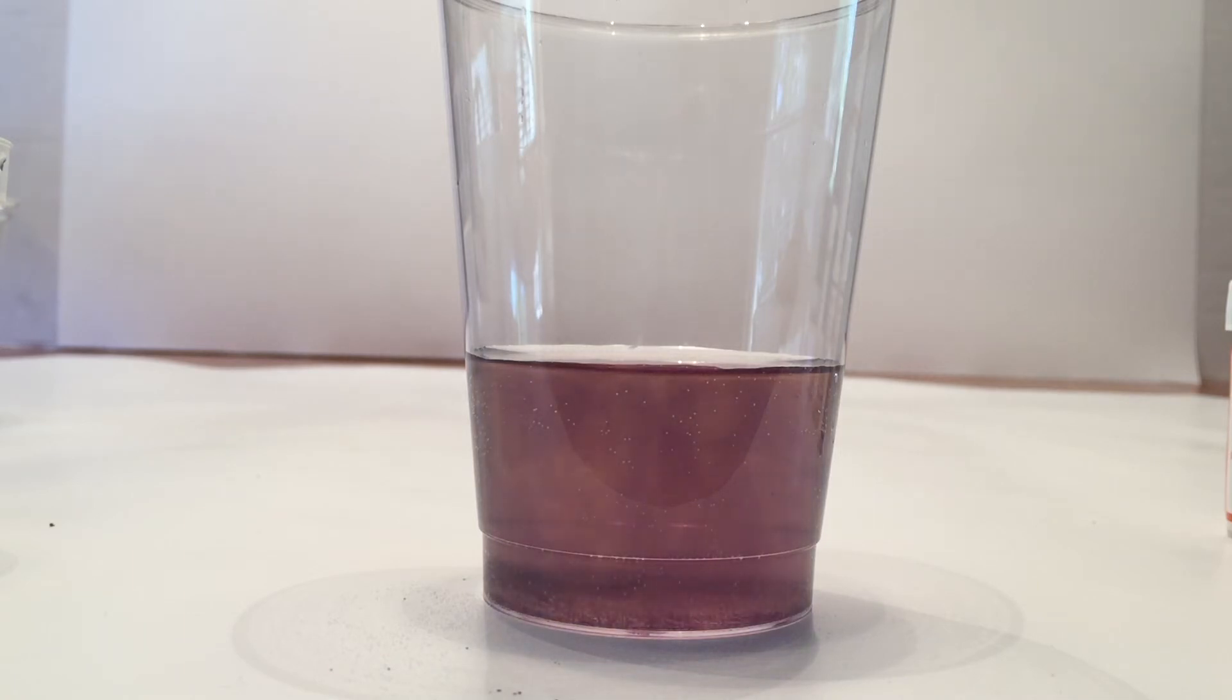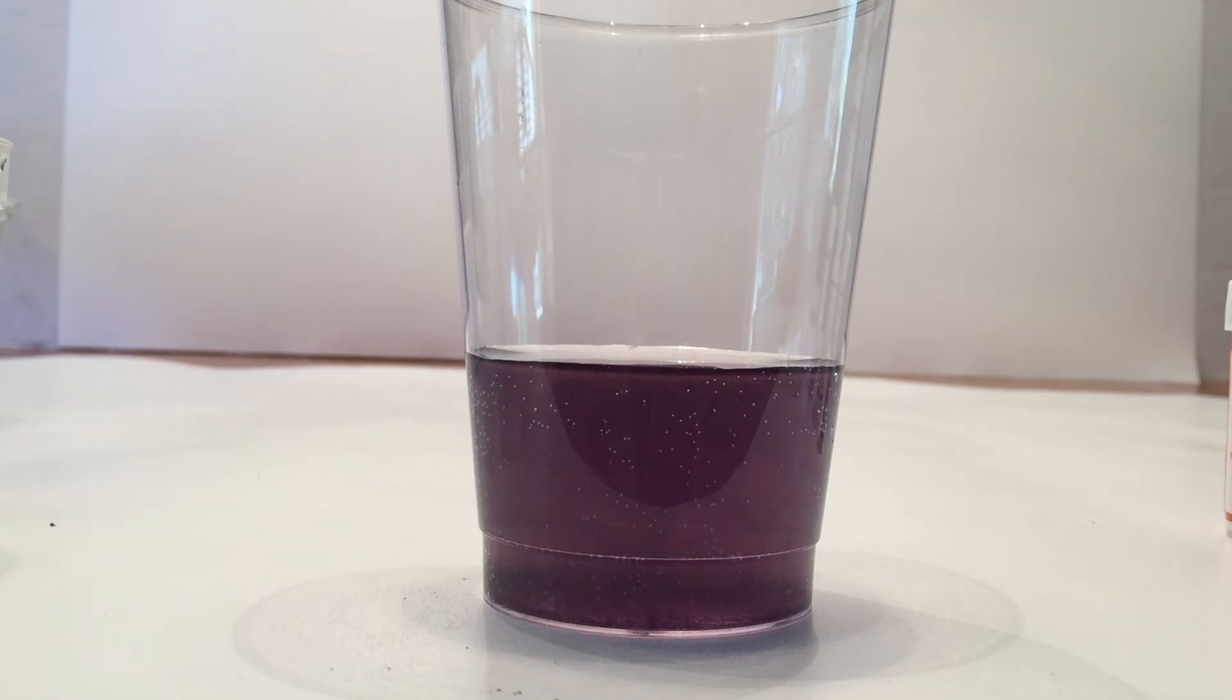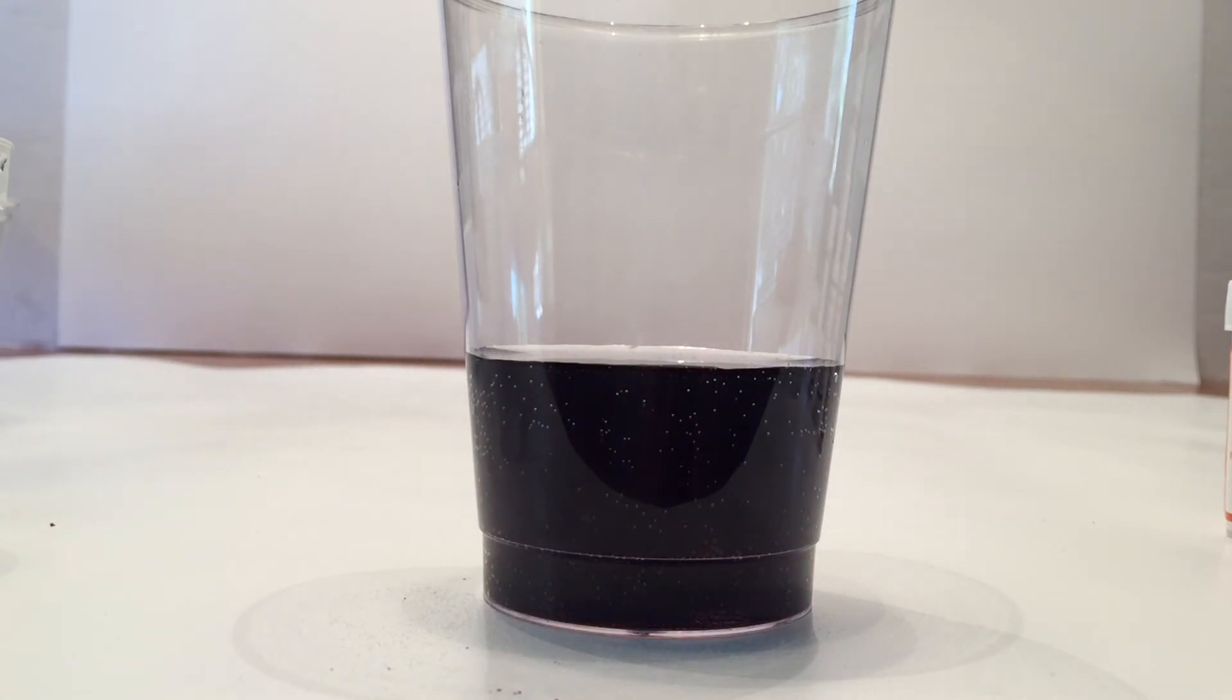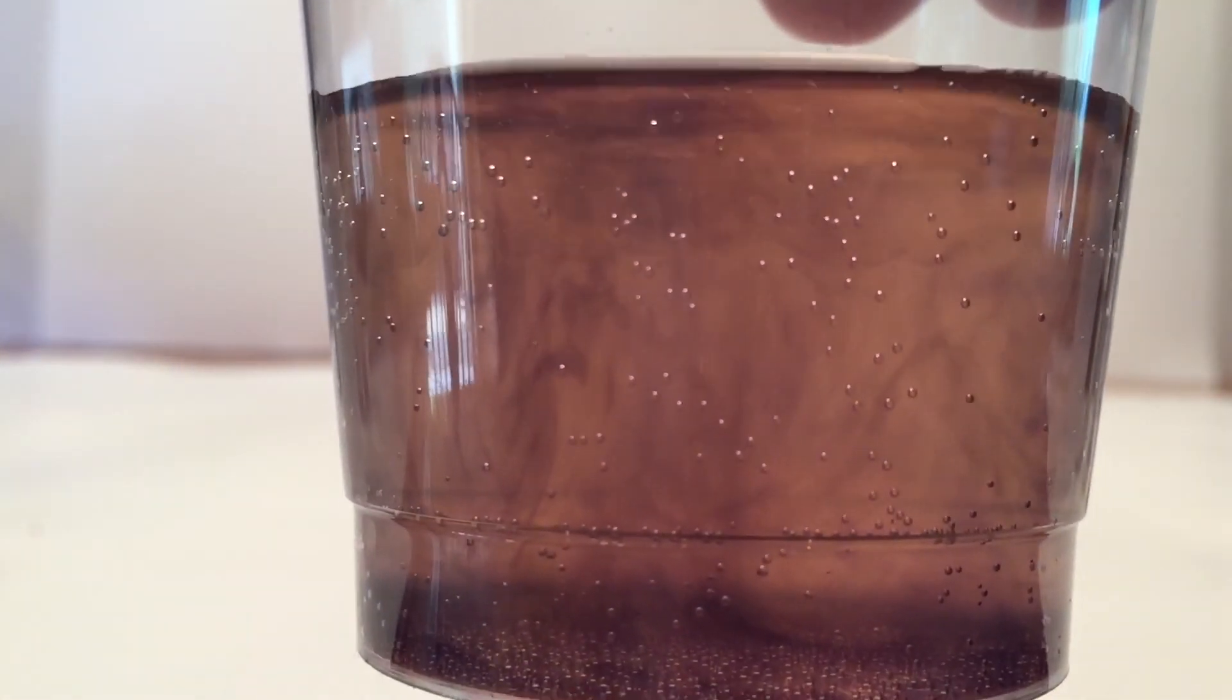How does this whole thing work? Well, there's many reactions going on at the same time. I'll try to simplify this the best I can. However, it still might be confusing. In this experiment, there are two main reactions, the one that generates iodine and one that depletes iodine. At the very beginning of the reaction that produces iodine dominates, which is why the solution turns yellow. Then the iodine complexes with starch and it starts to turn a blue black complex. The iodine then cuts off its own production and the reaction that depletes the iodine takes over. The iodine is used up and the iodine starch complex dissociates and the solution reverts back to a clear color.